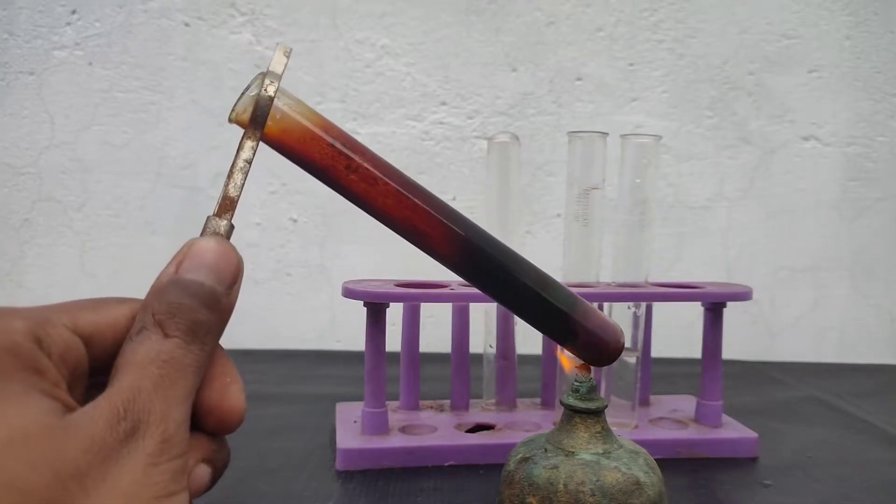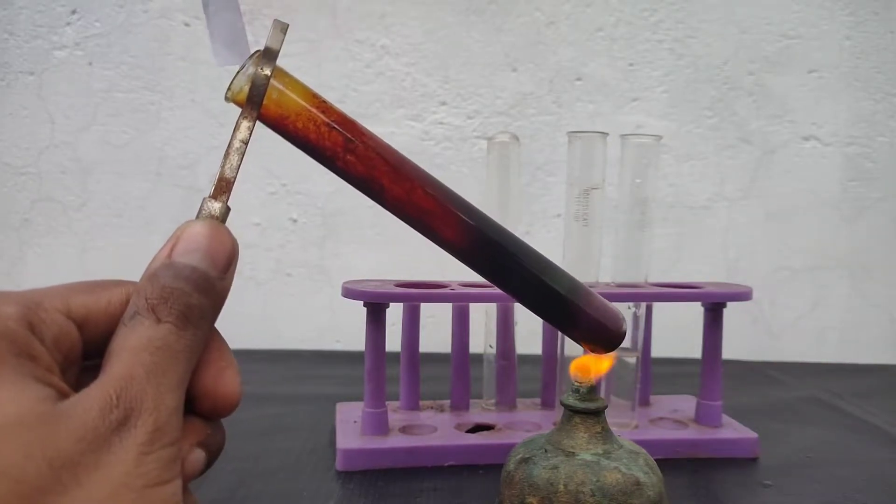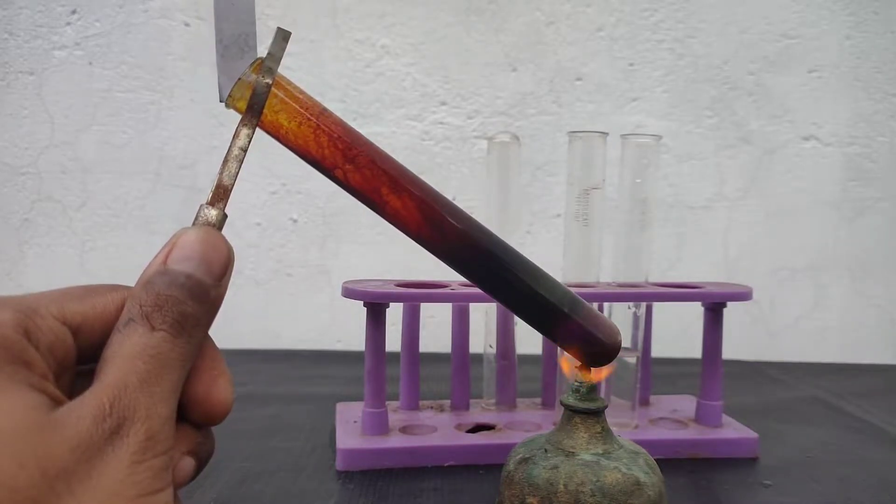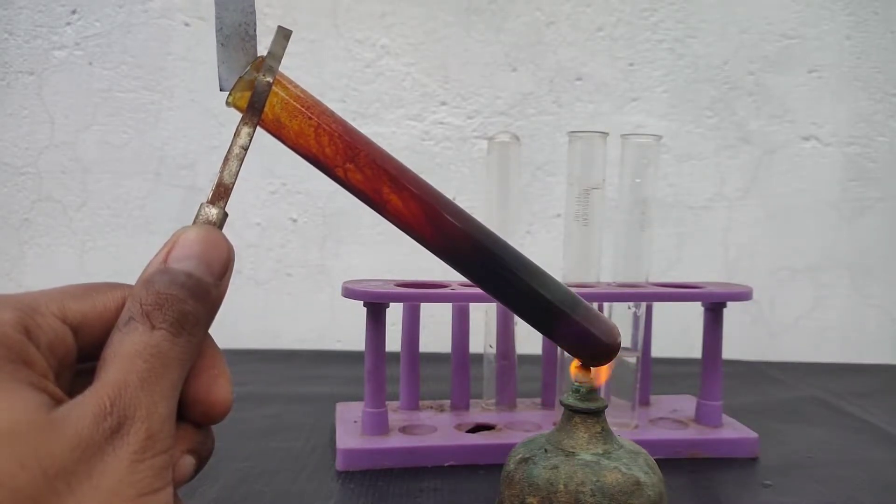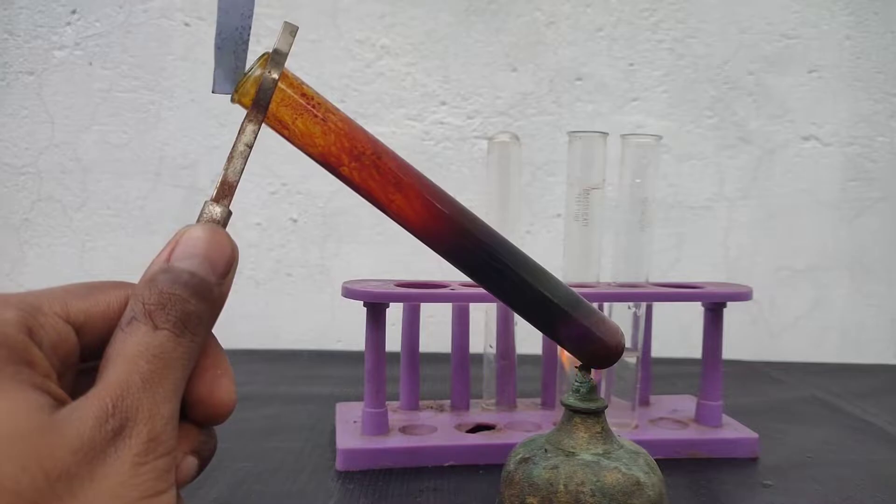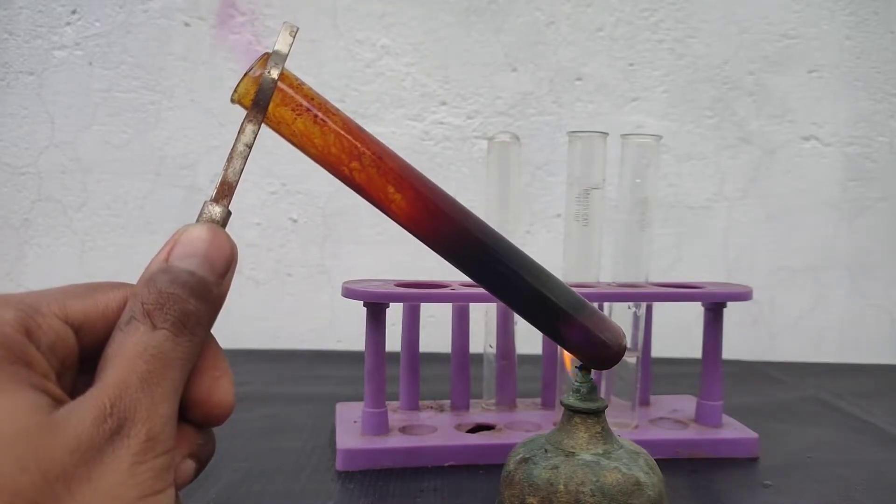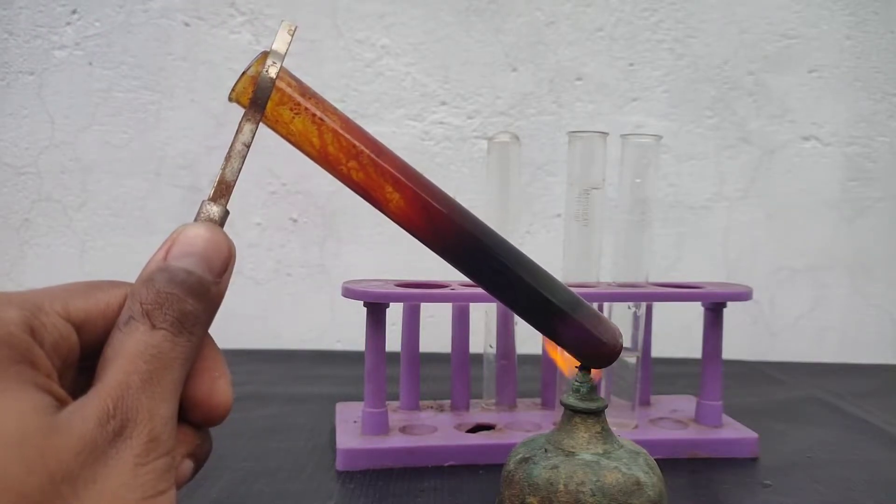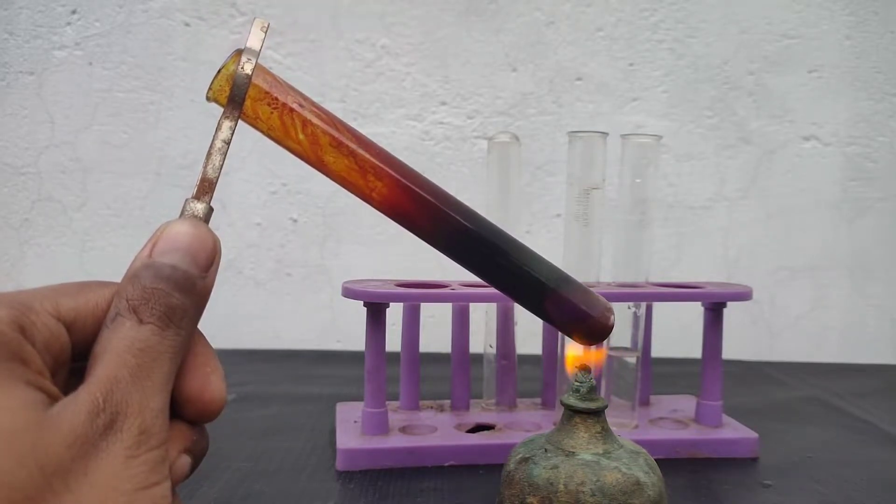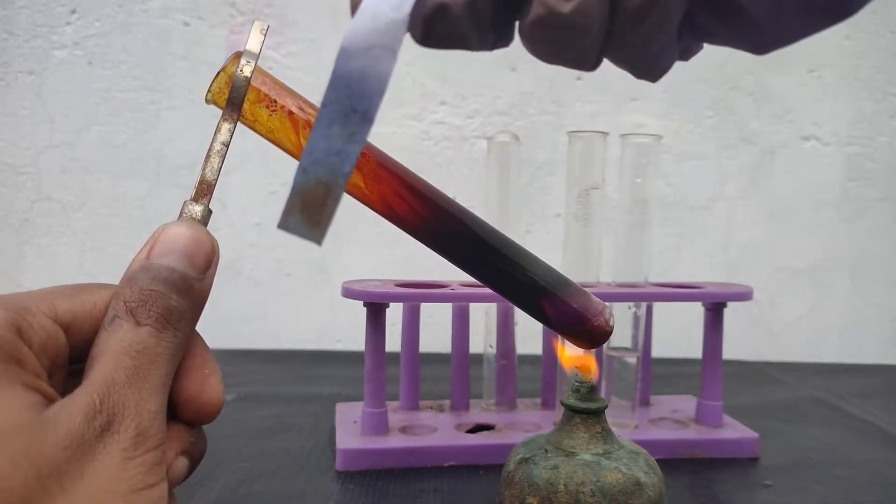You can also test these vapors with a starch paper. Just bring a starch paper at the mouth of the test tube. Appearance of a blue-black color confirms iodide. You can see violet vapors evolving outside the test tube, and it turns starch iodide paper blue-black.